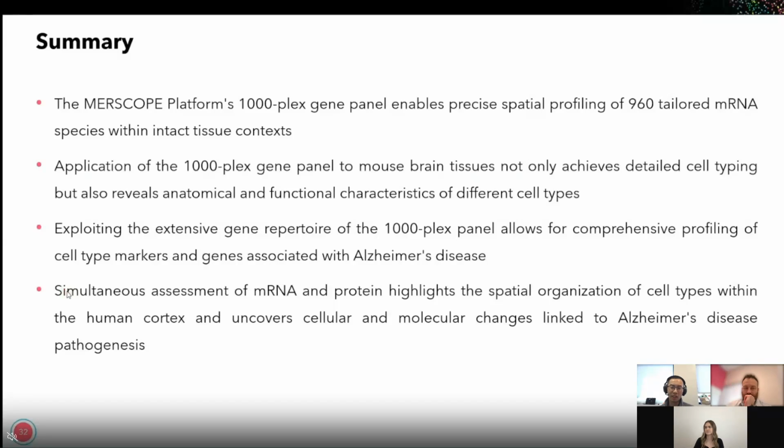And if you want to use some automatic annotation, that's also doable. I think there are some atlas or reference data that have been generated, and some algorithms can automatically annotate those cell types based on molecular information. But I think it's always helpful to check the annotation by plotting the cell spatial distribution, and then you can do some manual adjustment if you think that's not correct. Yeah, that's my answer.